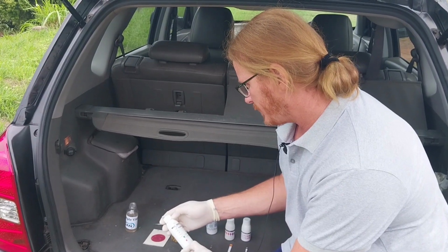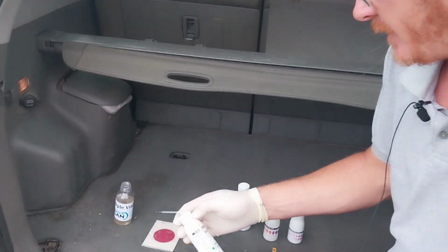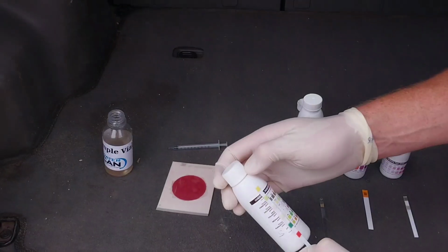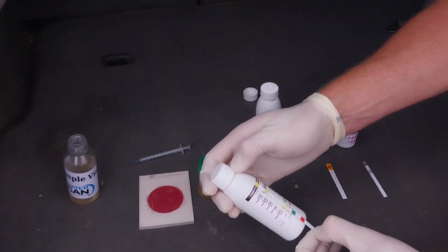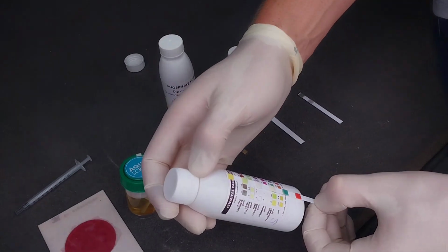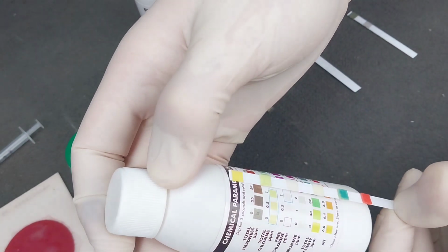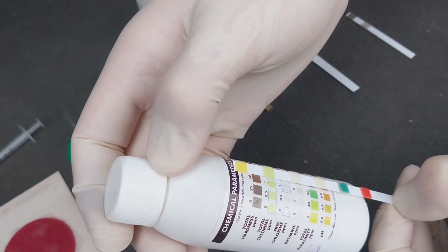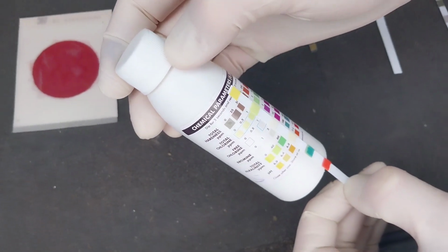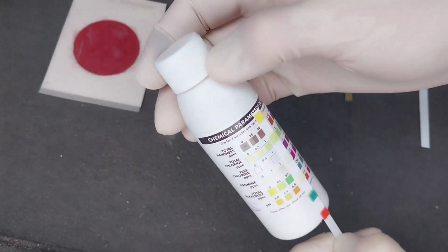We've got low bromine, so that's great. Bromine's just one of the measures that we check. It has no direct effect, but it obviously points to a bigger picture. We've got very low, let's see, I think about 0.5 of free chlorine. So there's minimal chlorine in this water. Free chlorine, and total chlorine is also only about 1 part. It's pretty much in the safe range.